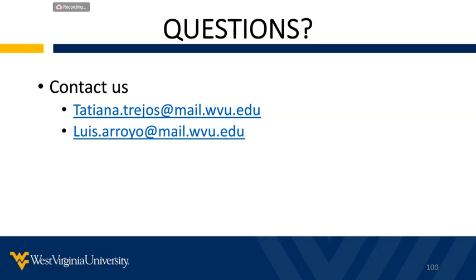So the last question we have that came in right now is asking, does LIBS have the capability to detect GSR even after thorough hand washing? So that's part of the activity population that I mentioned before that we haven't studied yet. So we don't have that answer yet. So we will have to evaluate that.